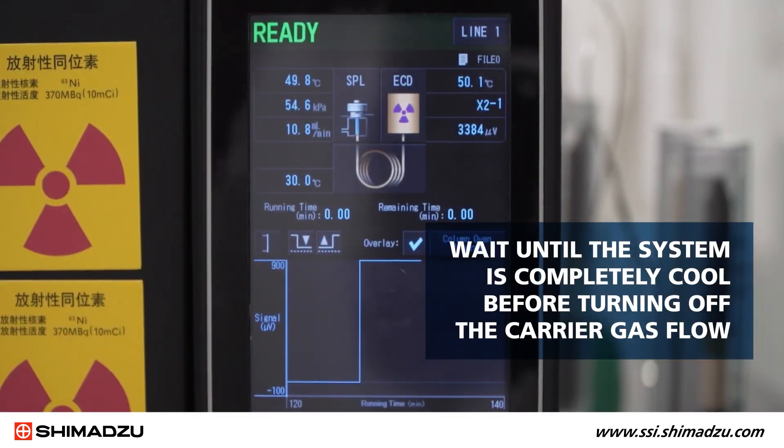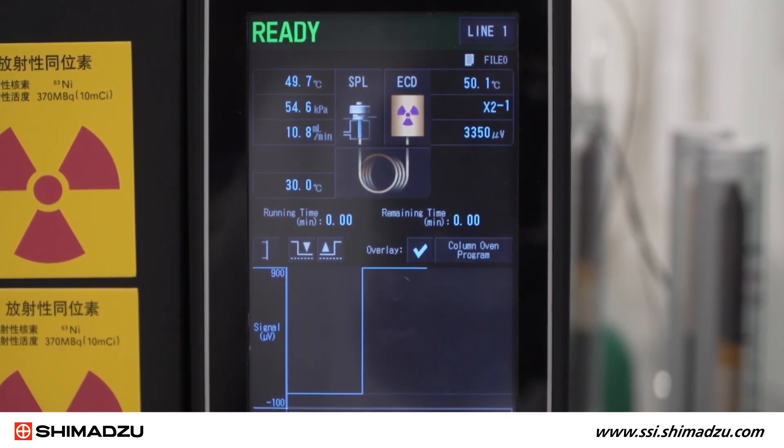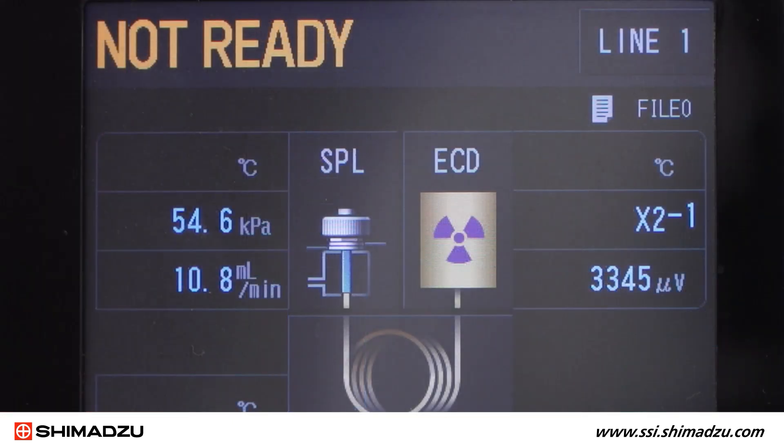It's important to wait until the system is completely cool before turning off the carrier gas flow. Turning off the gas flow while the GC is still hot could damage the column and some detectors. We recommend that all temperature zones be below 50 degrees Celsius before the gas is turned off.